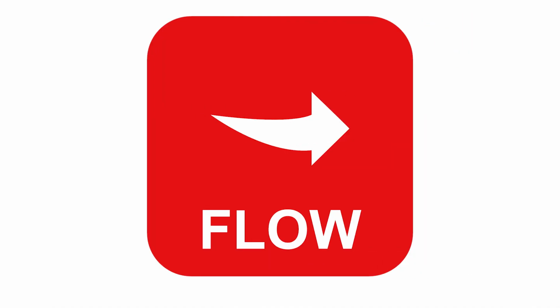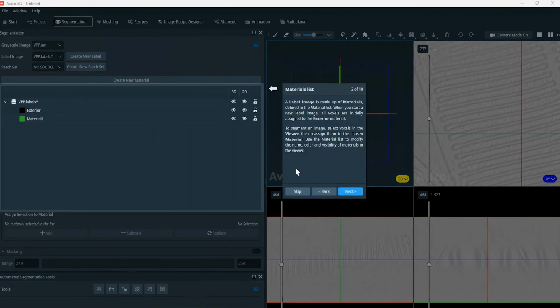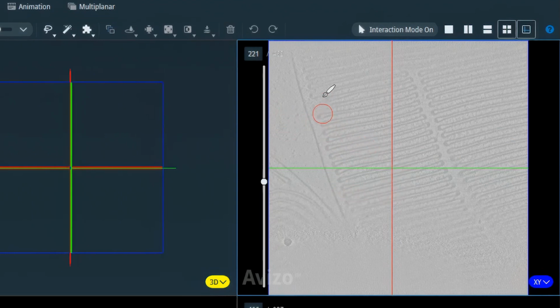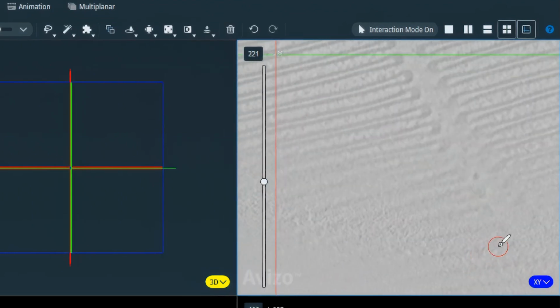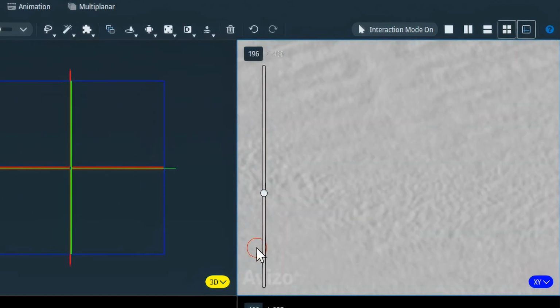Finally, we have redesigned the user interface to keep you in your flow. When using segmentation tools, it's important to maintain focus and complete tasks uninterrupted. The segmentation tools now work both at high and low level of zoom, allowing you to toggle between high-speed segmentation and low magnification and high-precision segmentation when zooming in.